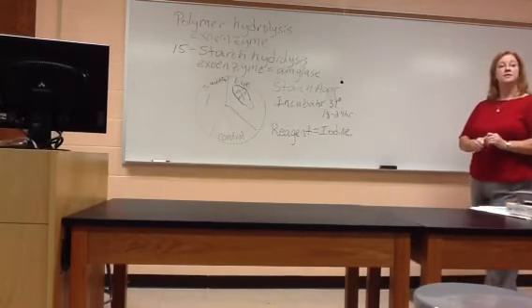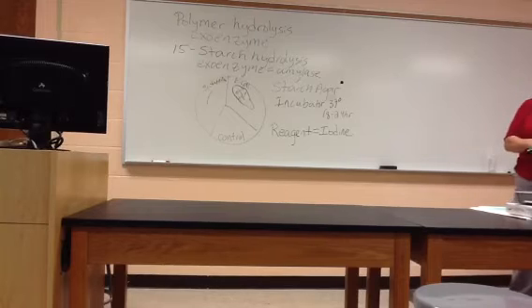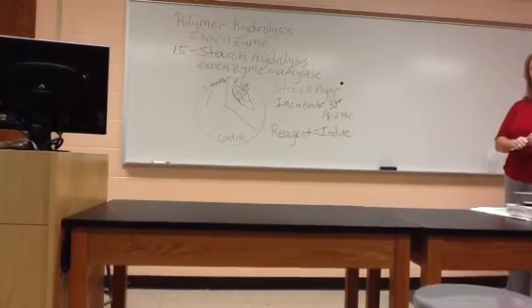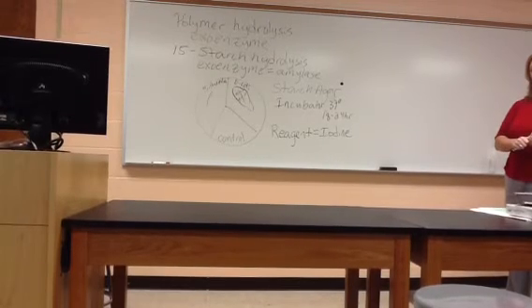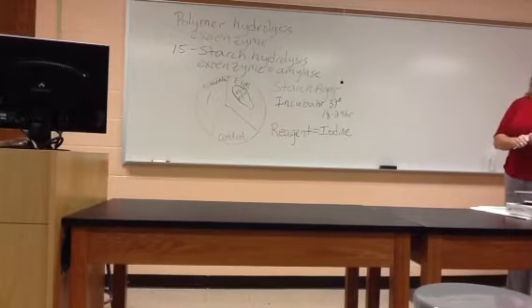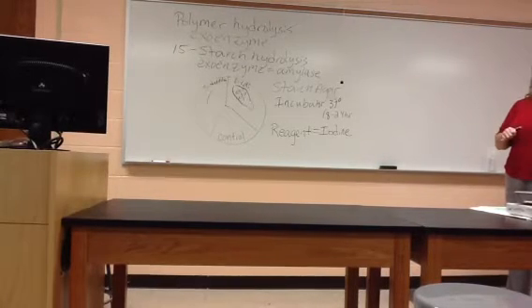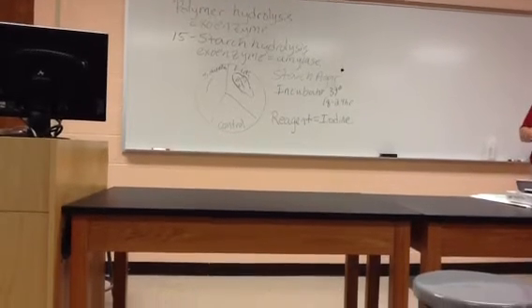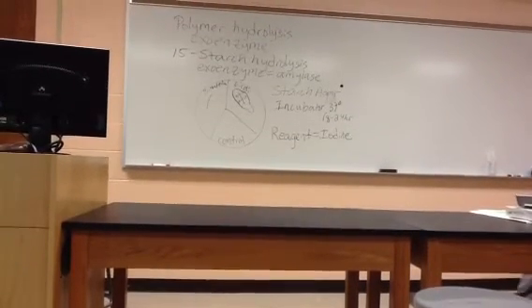Then the iodine transfers through. Oh, I remember that. The reason for the positive or negative result, that's telling us if they're sick or not, right? Well, no. We haven't even gotten to that point. If you're really doing this in the real world, they're already sick by the time you get this sample. They're definitely sick. We're trying to figure out what they're sick with.